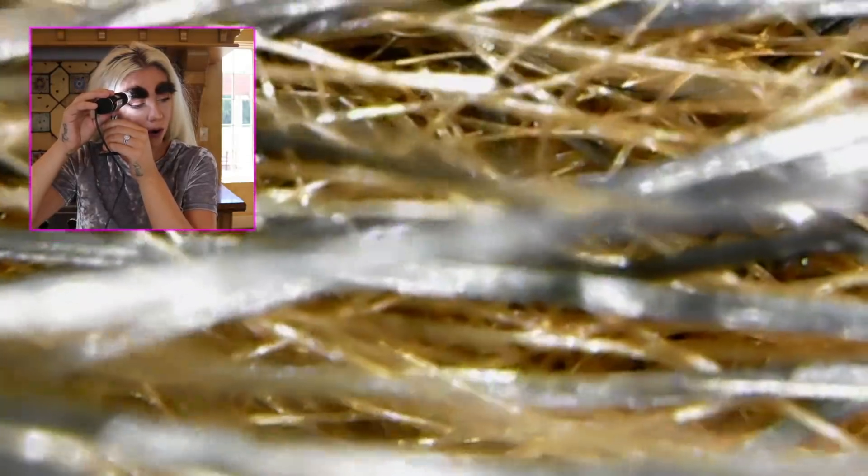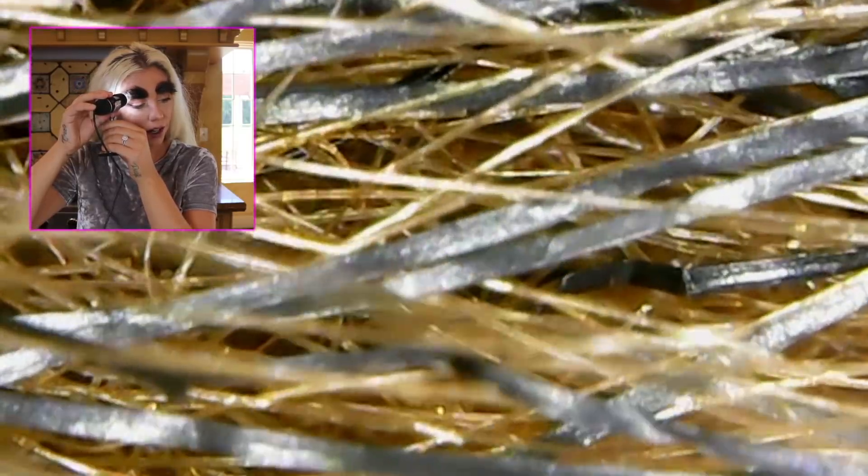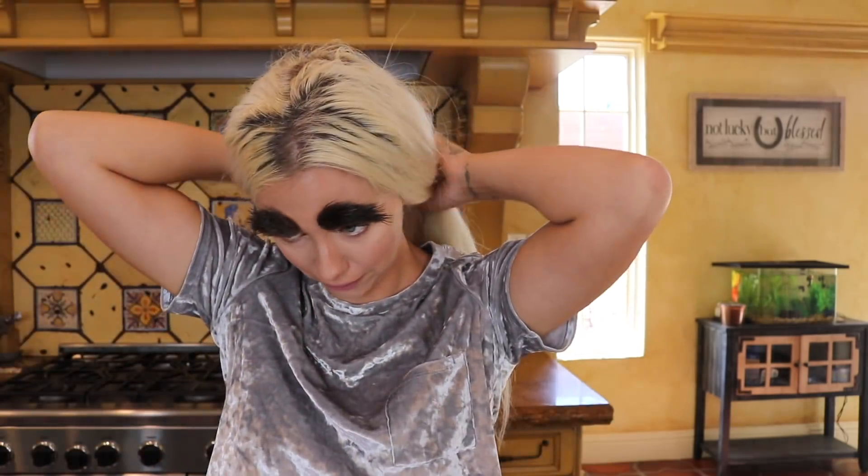Let's check out what my eyebrows look like. Oh my god, look at my brows — I know my brows are on fleek today. Do you see that? Look at all the hairs. Whoa, that is insane. Synthetic hair — that's what it looks like. Let's take a look at my real hair and see what my ends look like. I'm afraid — hold on, this is my hair.